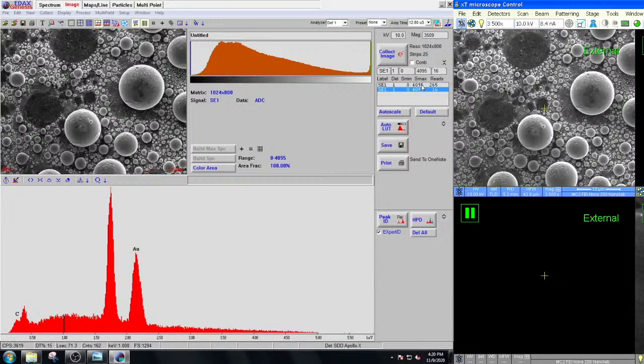You can look at these things. These are just readings of the image intensity of the various images you've acquired. I don't exactly remember how all this works. A lot of it's in the user manual, but these are functions that I've never used. You can hit auto scale, and it'll do an auto brightness and contrast on the image. I don't know if you can tell, but my contrast and brightness are a little different between the live image and the Genesis image. You can also apply lookup tables to this value. As you click through the lookup table, it does some adjustments to the brightness and contrast.